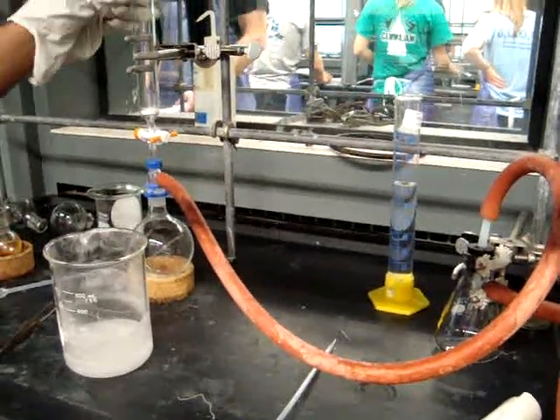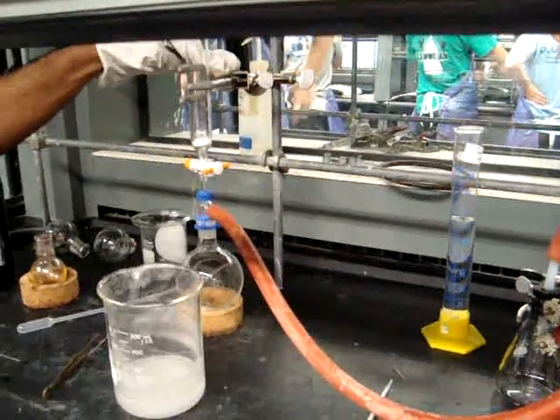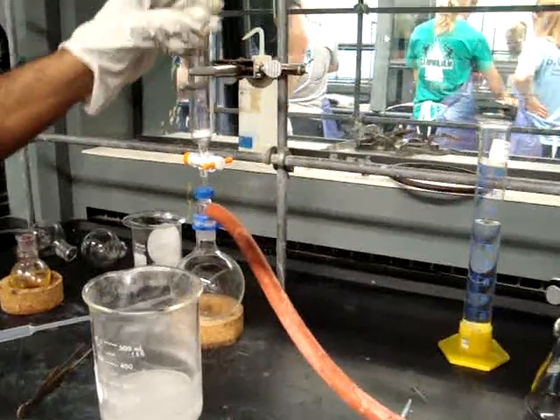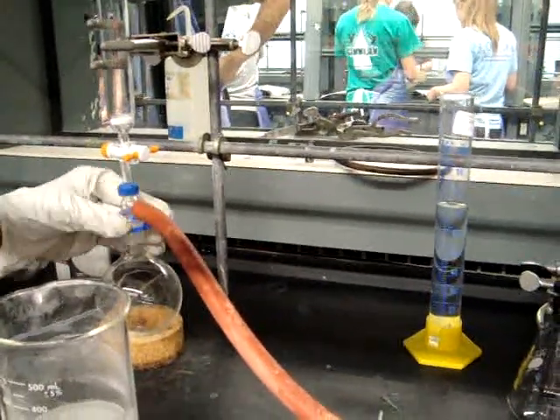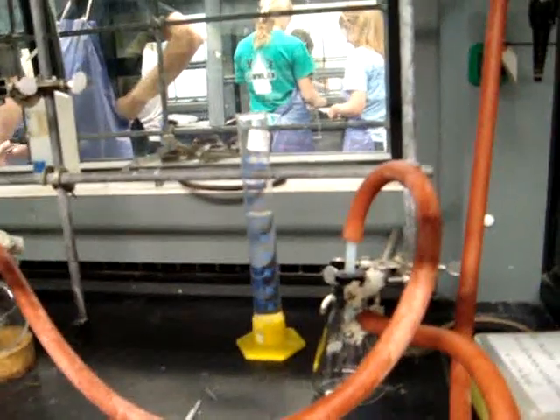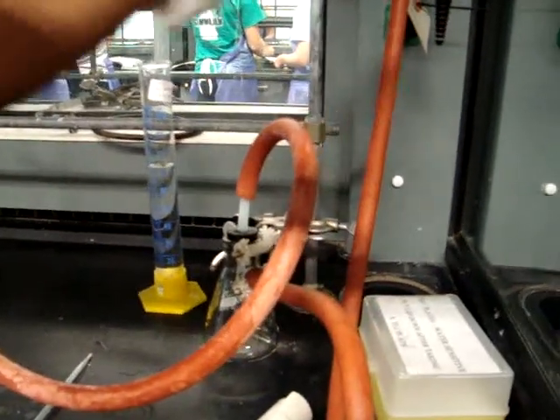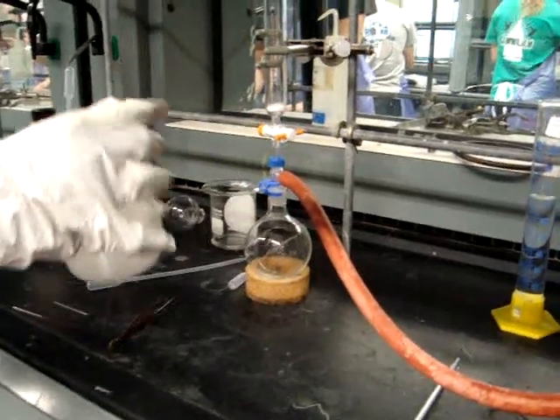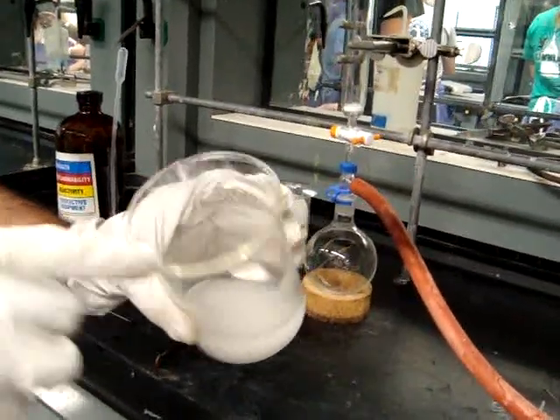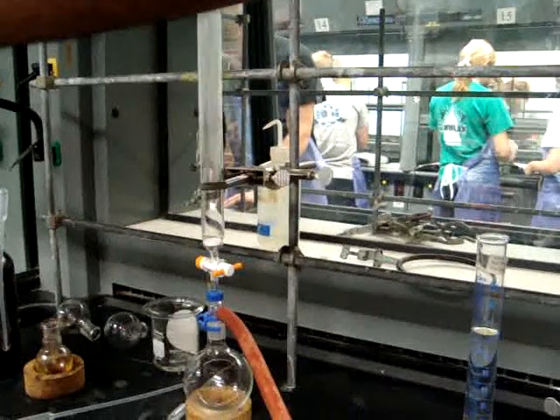You'll need to set up the column for the column chromatography by first getting the special column that you will need at the front. You'll need to clamp that column onto your lab bench and then add a large round bottom flask to the bottom while packing it. You'll then connect that to the trap, making sure that everything is clamped. The trap will then be connected to the vacuum from the side, just as we've done in the last two weeks. You will then take your slurry, which is 18 to 20 grams of silica and 80 milliliters of PET ether, and pour it through the top using a funnel.